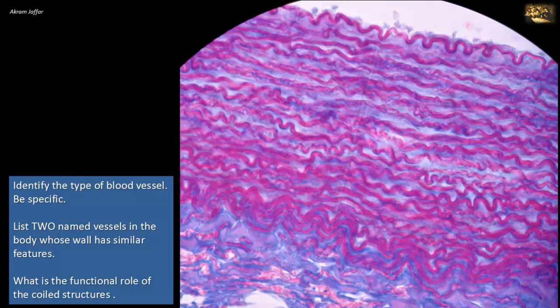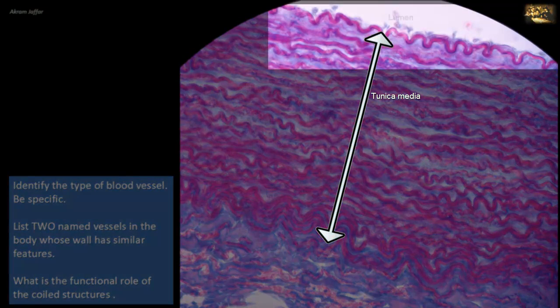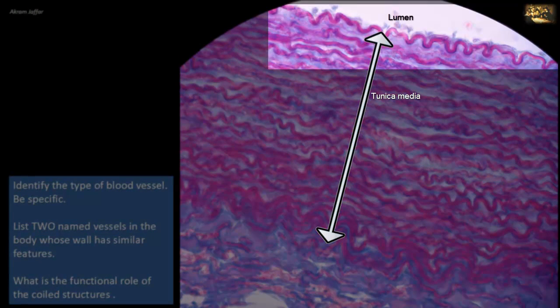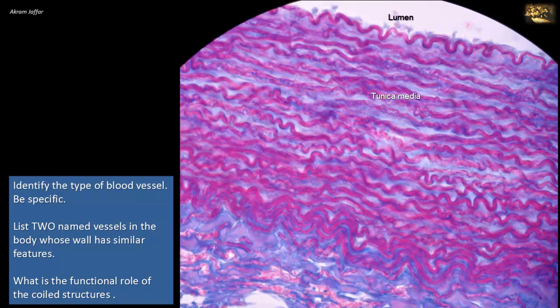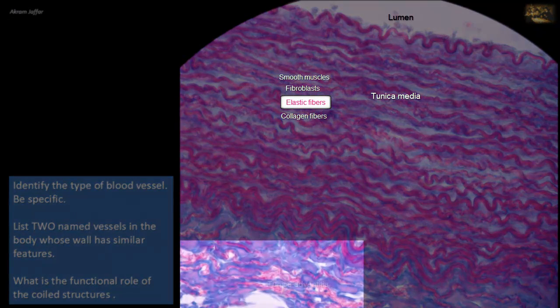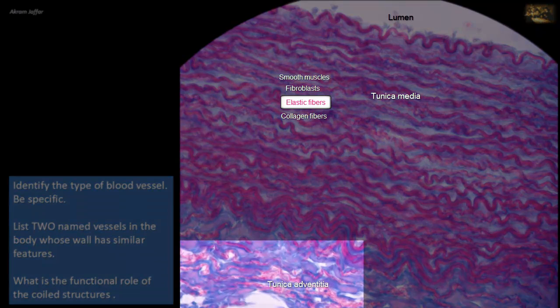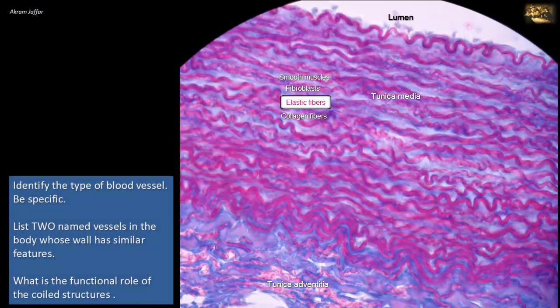Most of what we are seeing here is tunica media. This is the luminal surface. It has a thin, not clearly visible layer of tunica intima, and we can see that in the tunica media, in addition to smooth muscle cells, the tunica media is seen to consist of concentric fenestrated sheets of elastin, separated by collagenous tissue and smooth muscle fibers. So again here, the predominant feature of the tunica media is the presence of elastic fibers. Part of the tunica adventitia is also shown here. You can use it to compare the rich elastic tunica media with collagenous tunica adventitia.